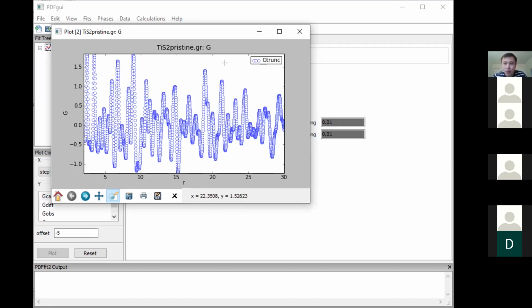And when it's transformed by the Fourier transform and goes to the R space, the consequence is you will have this kind of decay of the signal. So this relationship between peak resolution and the decay of PDF peaks is actually intrinsic. It's simply a mathematical relationship, so something you cannot avoid.